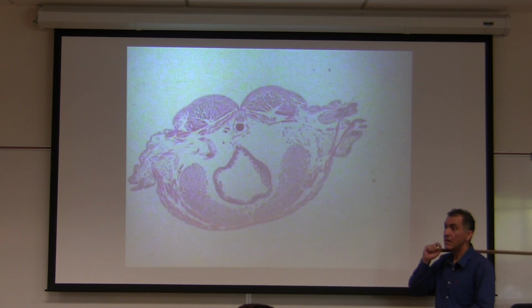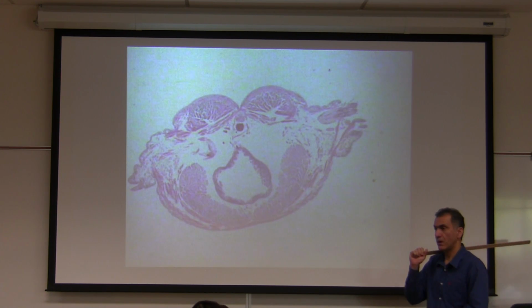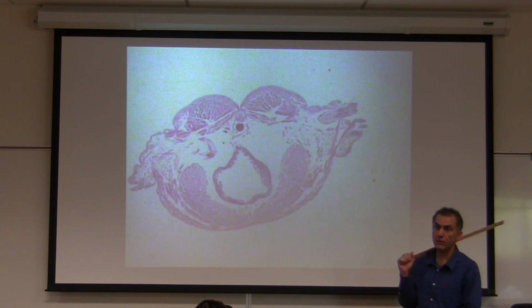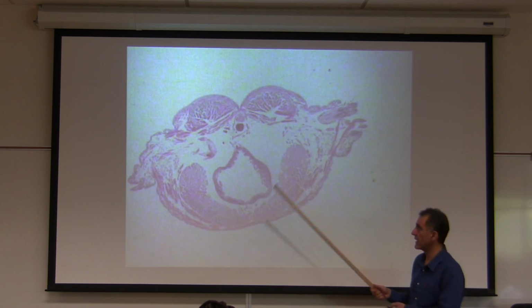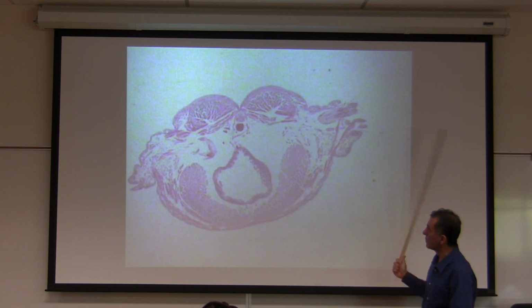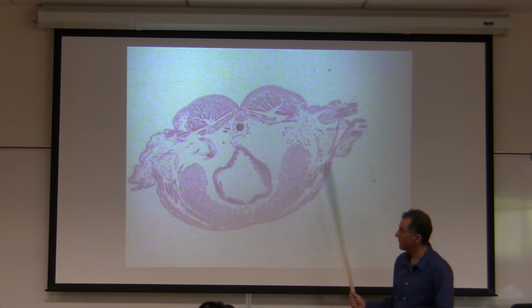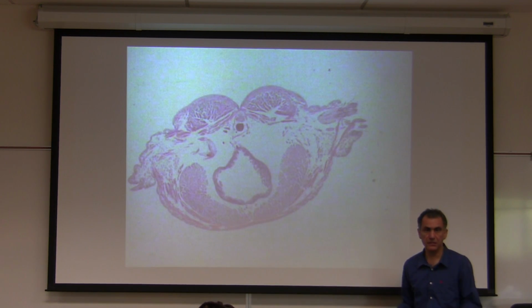Yes? Notopodium is bigger than neuropodium? That's right. Notopodium has capillaries for respiration, and neuropodium is smaller. And notopodium is used for what? Locomotion and respiration. It has a lot of capillaries. Same thing as you had before. The whole slide is on the dissecting scope, and I took a picture of it because this would not fit on a microscope.